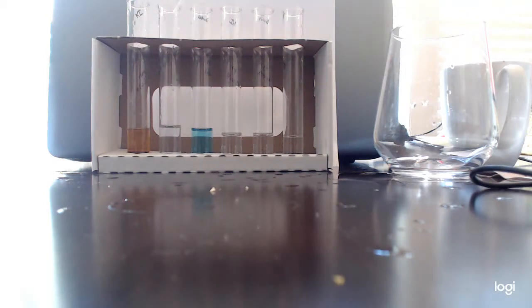Okay. Let's do orange juice in the Biuret solution that tests for proteins. 10 drops. Okay. And then last, let's do our orange juice test in Benedict's. 10 drops.